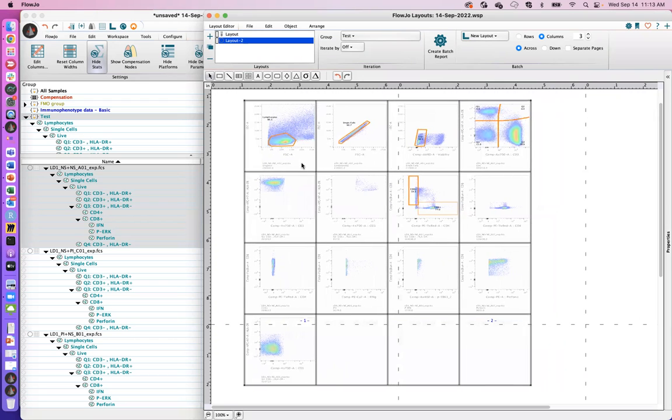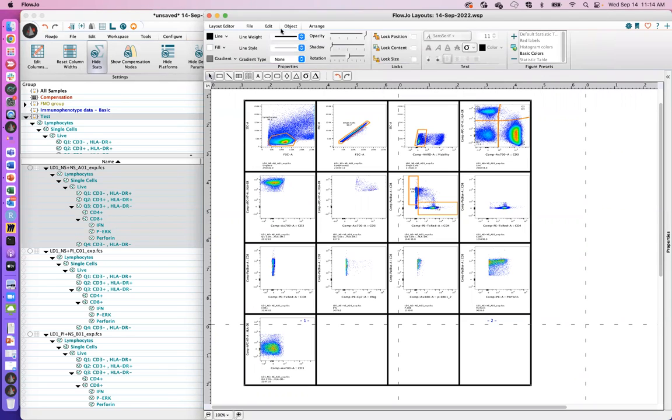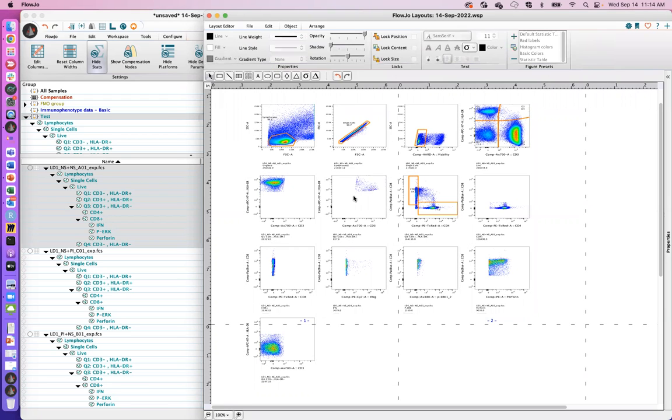Okay, and the nice thing is now you have all your plots arranged, at least they're spaced evenly and they're arranged right top to bottom. You can swap them in and out of the squares if you like. So rather than dragging them in all at once, you can drag them in kind of into the spots as you wish. And then if you want to get rid of the black grid around it, my favorite option here is just to tell it to not have a line. And in that way, your plots look nice and even.